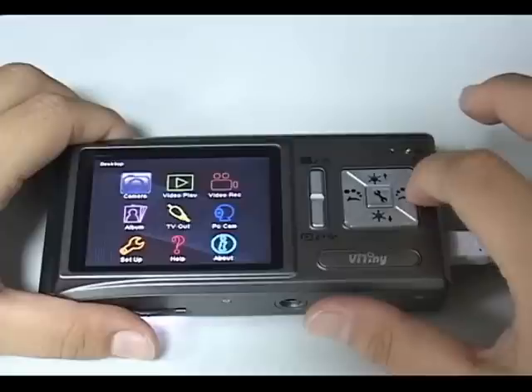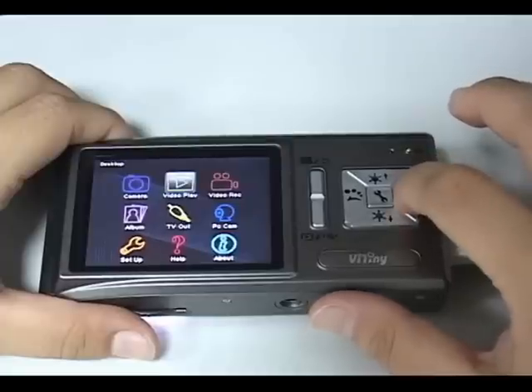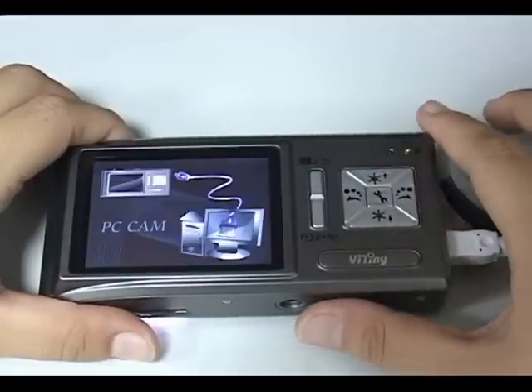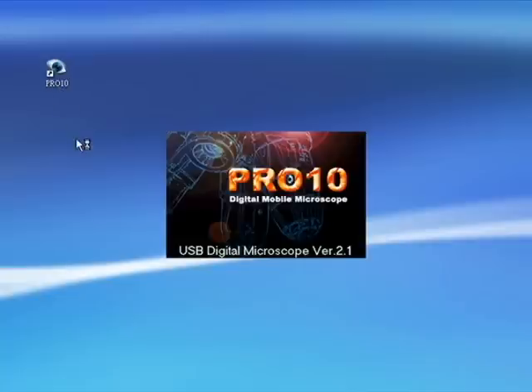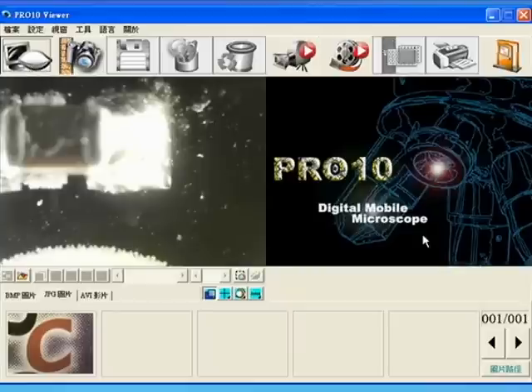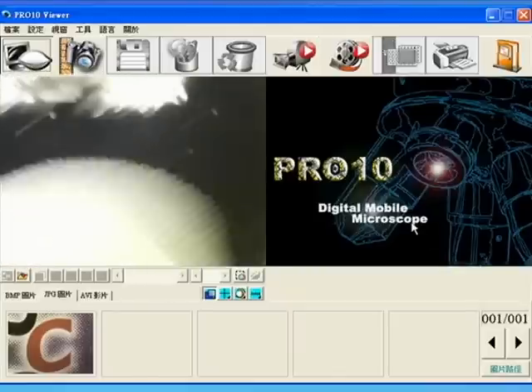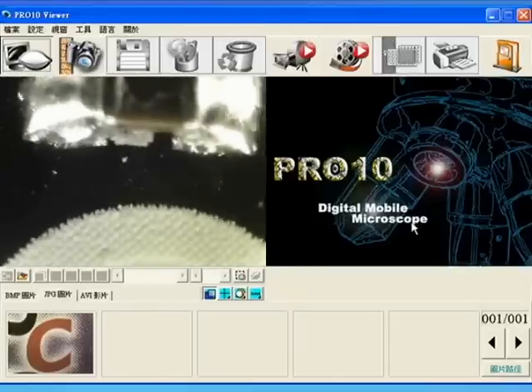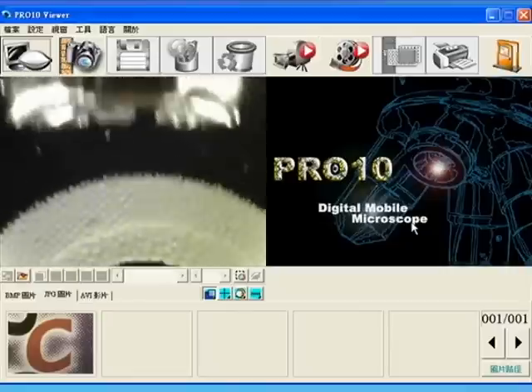Connect USB line, which is by PC Cam function. That can be used to preview and observe on the computer.